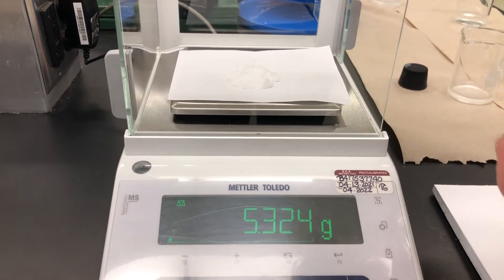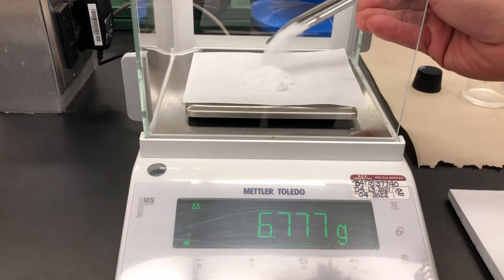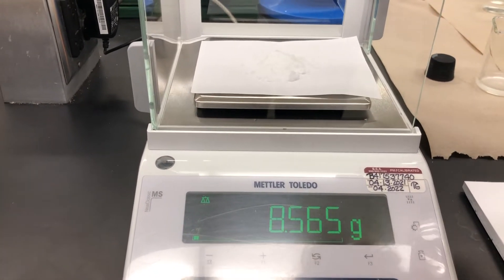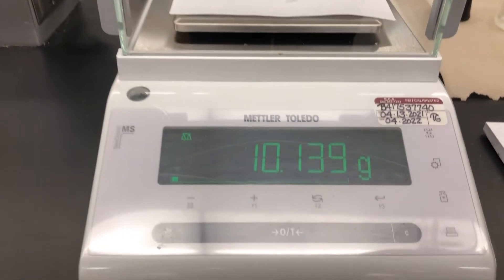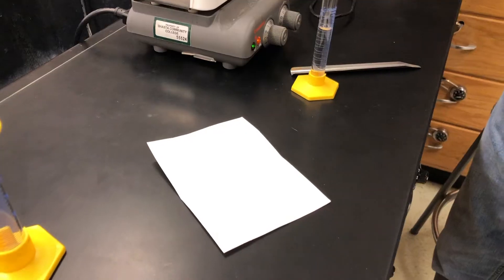This is a fair amount of KNO₃ — it takes a number of scoops. Okay, maybe one more scoop. That's going to be our final amount. Close the balance door, get your mass reading, and record the mass of KNO₃.